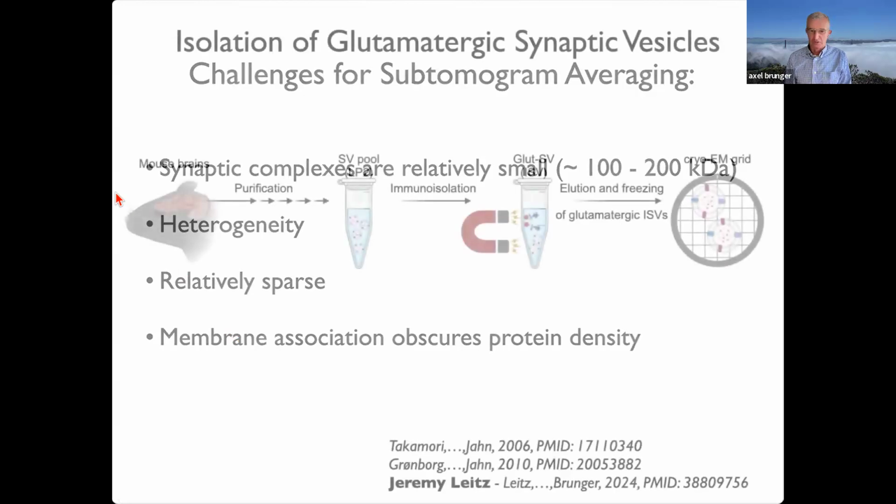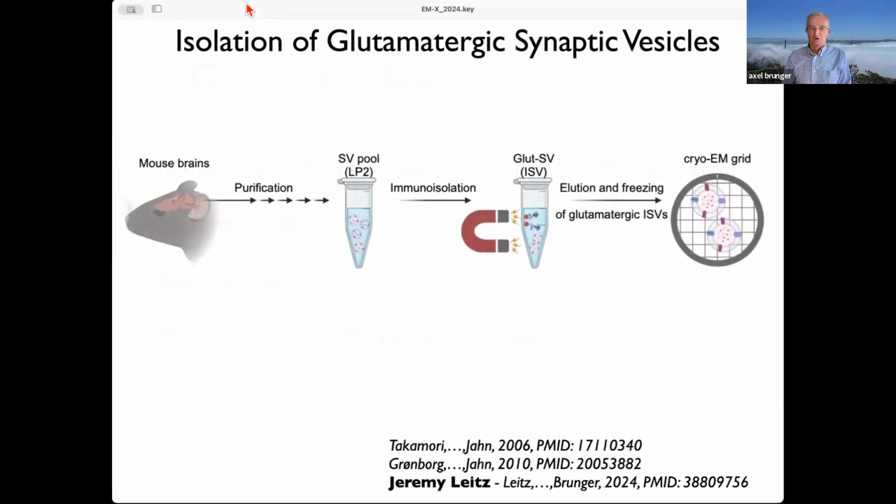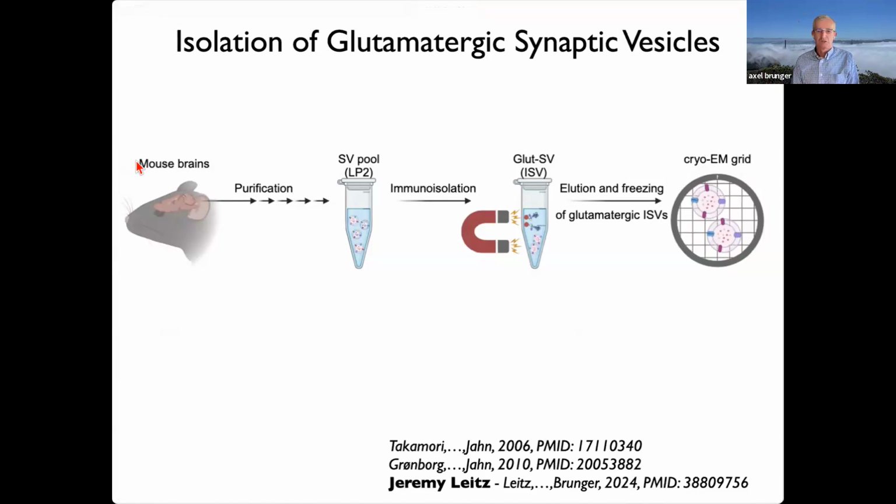One approach we're taking, and I only have time to talk about one, is using gold particle labeling methods, and that will be maybe another time, doing some really exciting work. But what I will tell you about today is the other approach we're taking, which is, instead of looking at individual synapses, we purify parts of the organelles. In this case, it's synaptic vesicles directly from the brains.